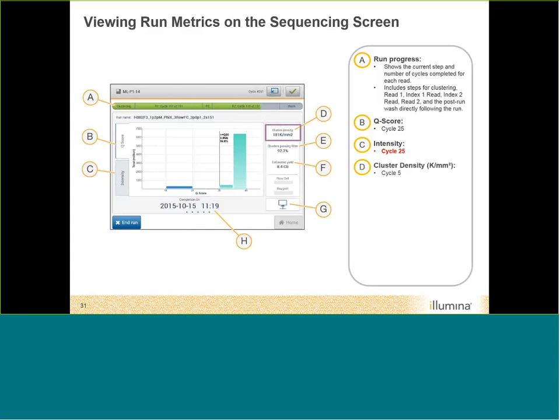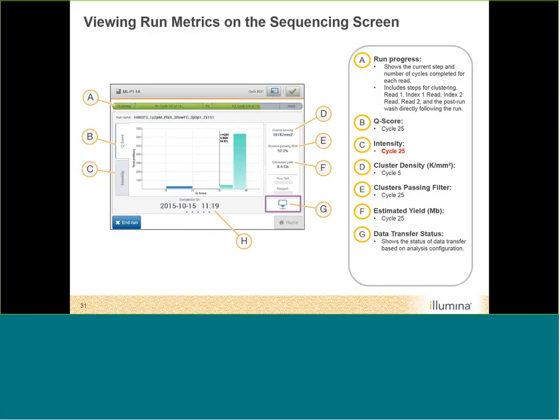After cycle five, you see cluster density information and an estimated yield. Time to completion tells you when the instrument expects the run to finish. This estimate is a learning process — your very first run may be inaccurate, but after about three or four runs, it becomes much more accurate. So don't be alarmed if your first run isn't complete at the estimated time.